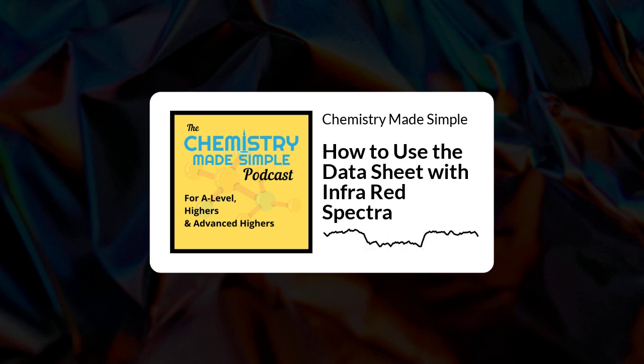Okay, let's have a brief summary of what we've talked about today. We talked about infrared spectroscopy being an analytical chemistry tool that we would use with organic compounds. We said that the principle is based on the fact that different bonds have different frequencies of vibration, and that's down to the atoms that are attached by the bond and also the chemical environment around them in that molecule. We said that we can pass a beam of infrared energy through a sample and measure the amount of energy that passes through the sample and gets to the detector and plot that against the wave number of the energy. And that gives us an indication of what bonds might be present.